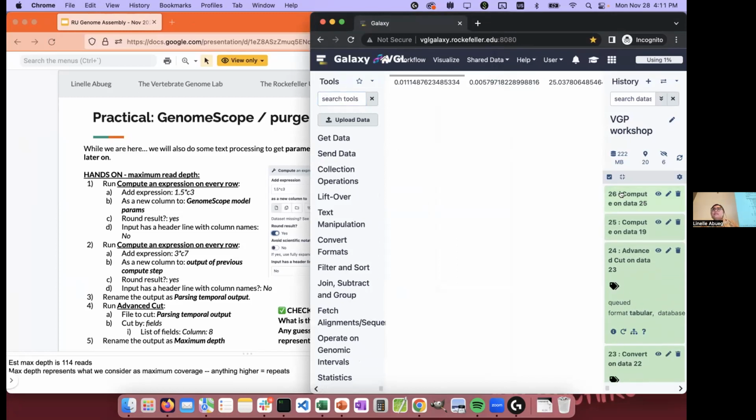It's an expectation. The 1.5 and 3 are the constants that you use for all the information. It's just the basic assumption: 1 is the haploid, 2 is diploid, and the peak. And then the 3 is just, it'll capture us, but yeah.